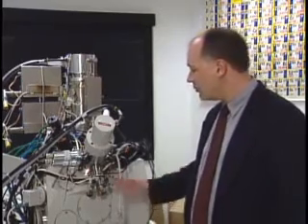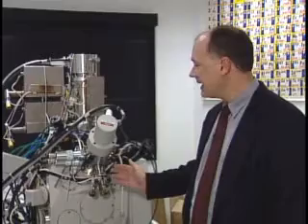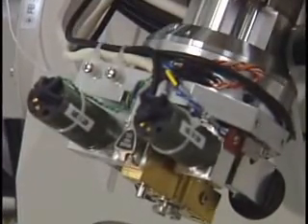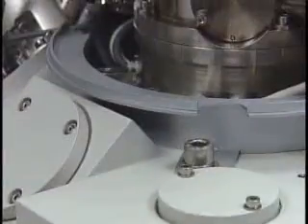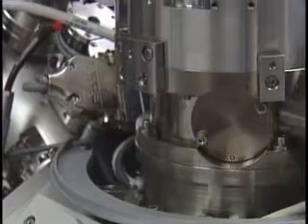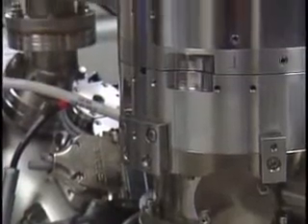This is what we call a dual beam microscope. It has both an electron beam, like an electron microscope would have, but it also has a focused ion beam. And the reason for having both of these is that we can do very different types of characterizations and different types of experiments.